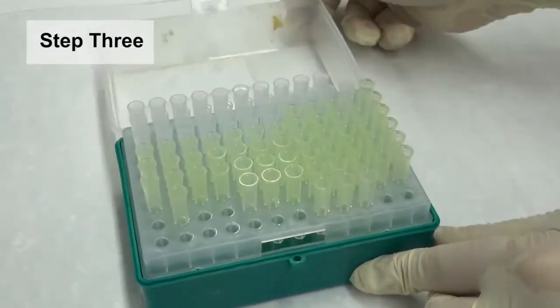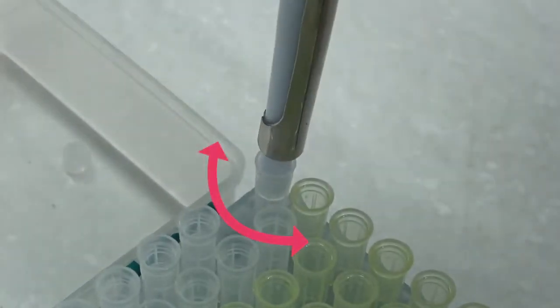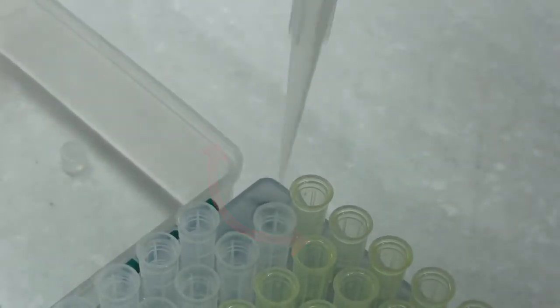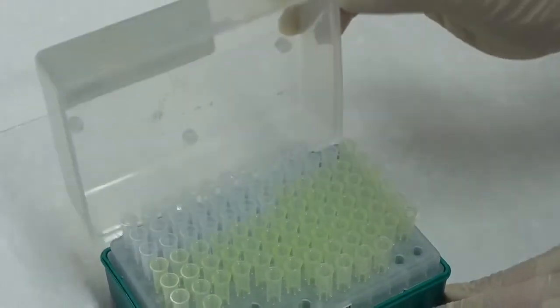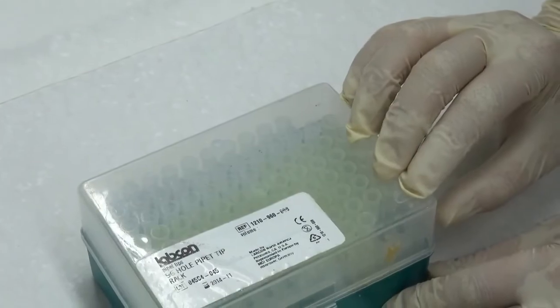Step 3. Open the lid of the tip box. Fit a tip to the end of the shaft with a slight twist to ensure a good seal. Close the lid of the tip box to prevent dust and contamination.